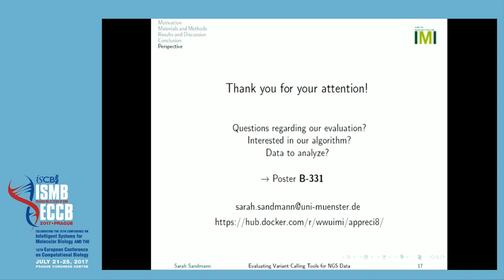And if you now add an allelic fraction which does not match or correlate to that ploidy, as for instance, when you say ploidy 2, it would expect, usually, because the germline callers, not somatic callers, have that ploidy setting in general. It couldn't work because, just to my understanding, if you set it to diploid and you add an allelic fraction which does not match that, then it's kind of what the callers should do, not to pick that up because you set it to diploid.